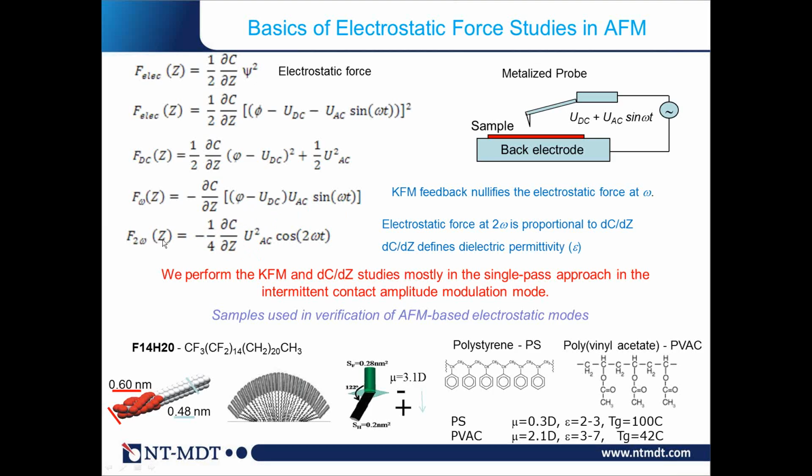We can measure the DC-DC component. The 2 omega response is related to the electric permittivity, and I will put a few words about that. Now, I will not describe the single pass approach. You can read it in some literature, and we want to devote a special seminar to that. But I will show some results on some standard materials we use.